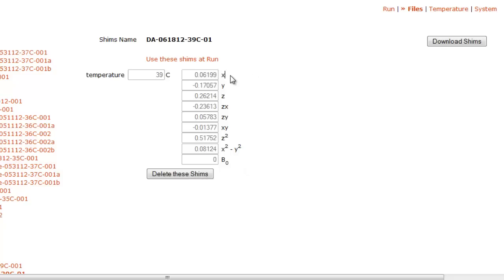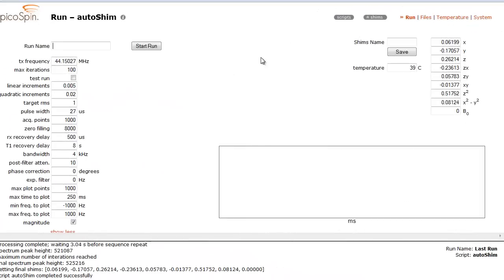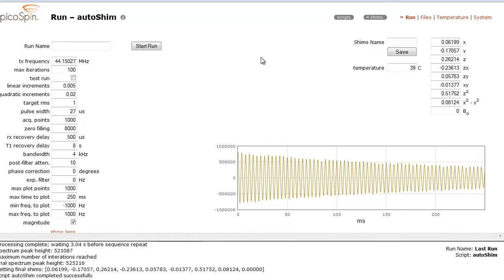Or we can reload the shim values into the run page user interface by clicking the use these shims at run button. This will automatically open the run page and make the shims active for whichever script was used last. And in our case, this would be the auto shim script.